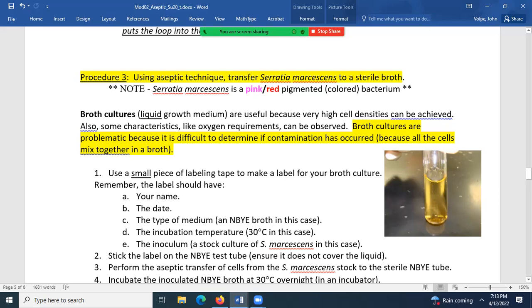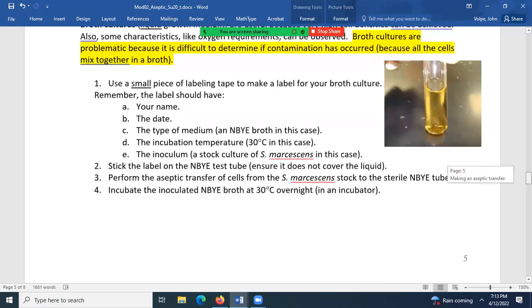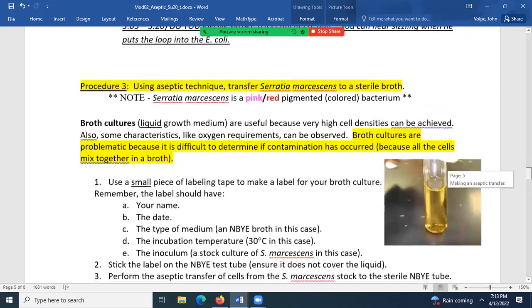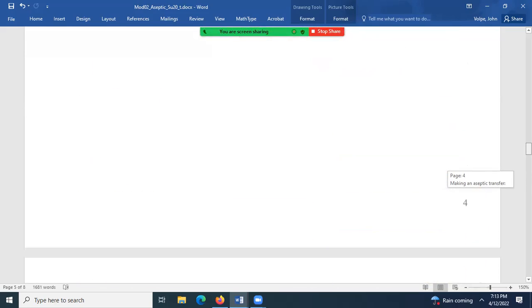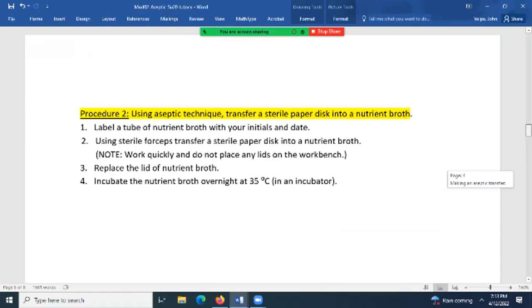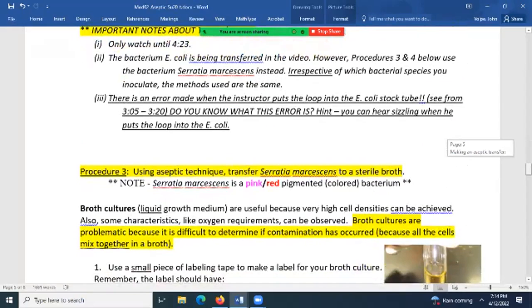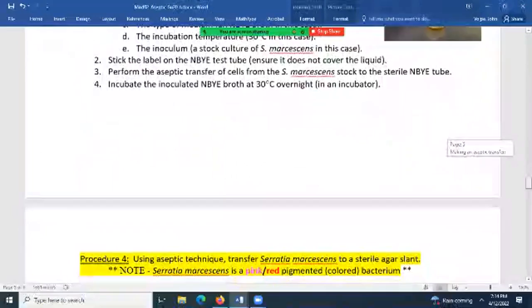Any question about any of that? I have a question about the forceps. You said it was semi-sterile and we would need to clean it beforehand. What are we cleaning it with? I think they state that in the directions here. It doesn't tell you how they sterilize the forceps, which, let me see.